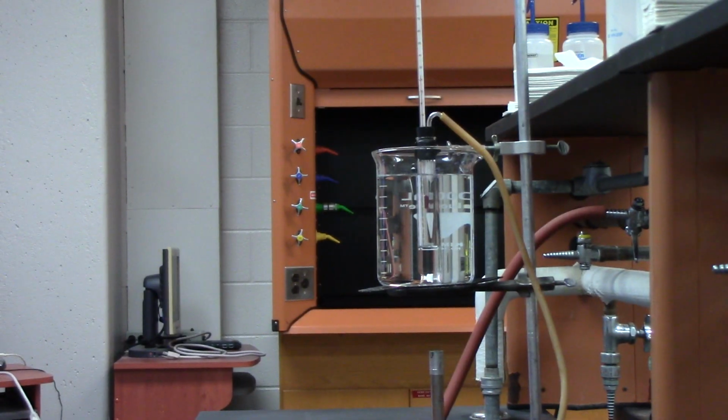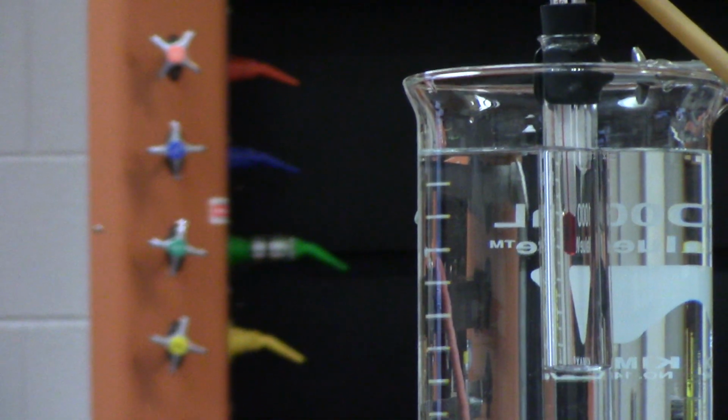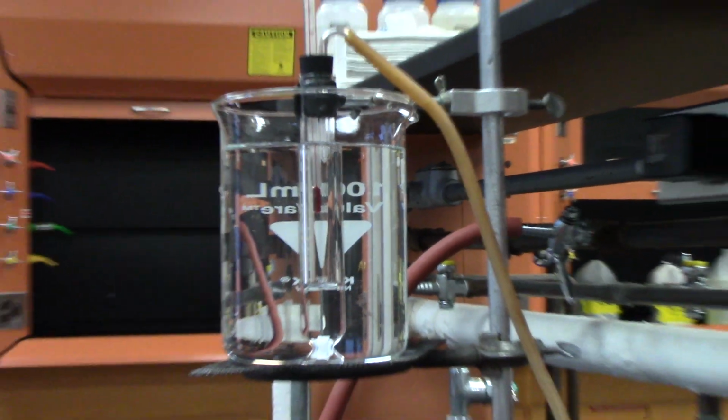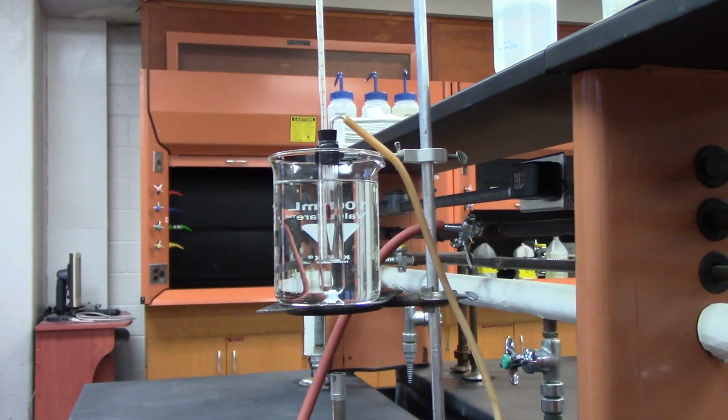All right. So in the background is the hood, and so let's see, move up here closer. And excuse the moving around here, but that's how it goes. Okay, so let's show you how I set it up.